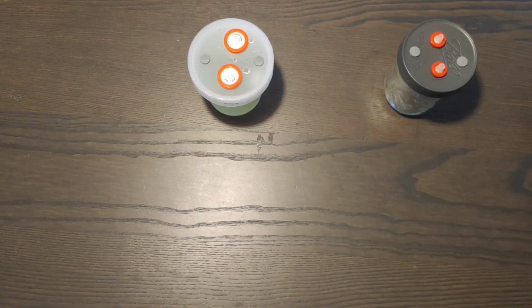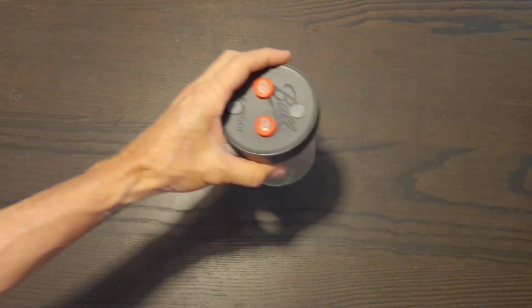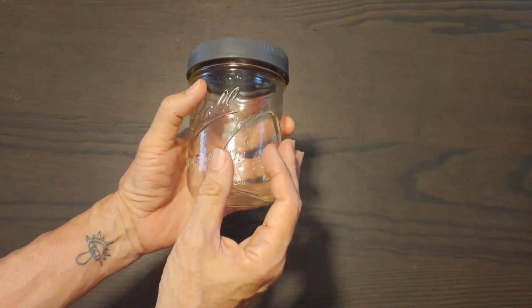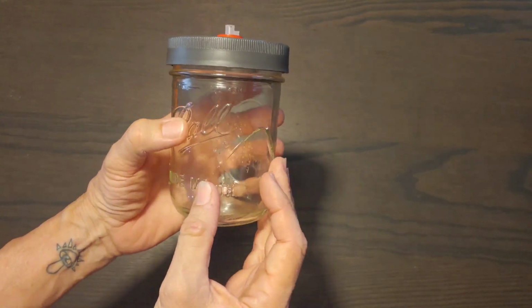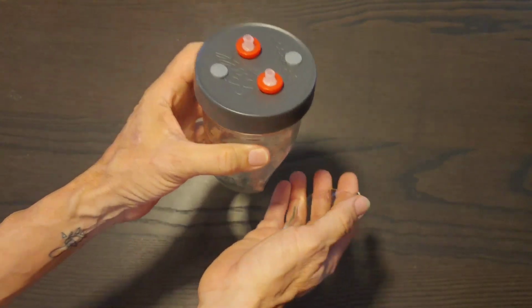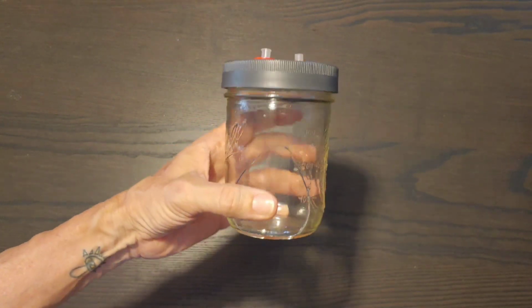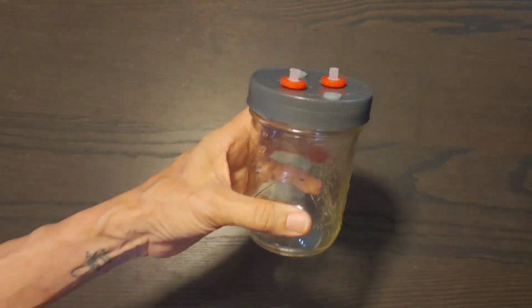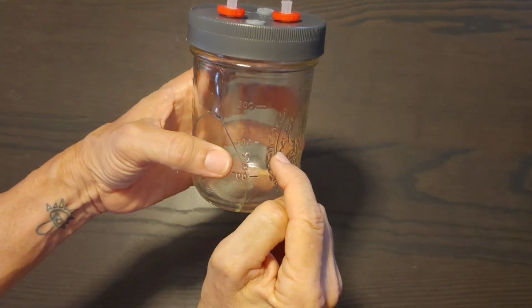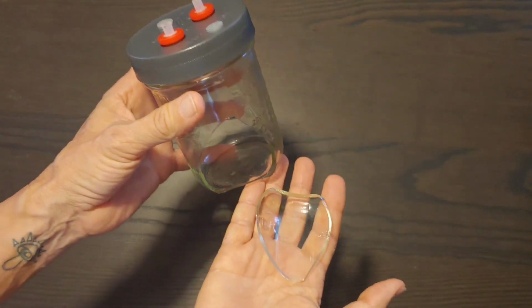Now, lately I've had 3 of these crack in the pressure cooker. Not when I'm breaking and shaking or anything, right in the pressure cooker. I made a liquid culture solution in here, and when I went to take it out of the pressure cooker, the water level was way down here, and then I noticed this, and it just cracked.